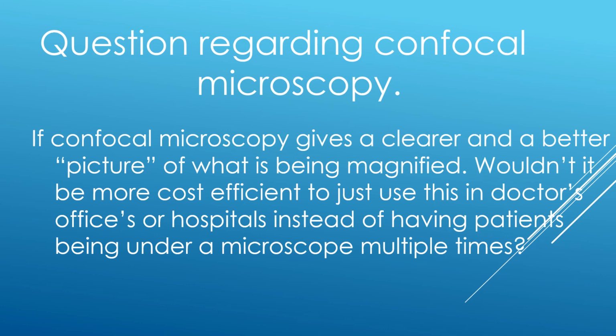So the question that I think should be answered for this is, if the confocal microscope gives a clearer and better picture of what's being magnified, wouldn't it be more cost efficient to just use this in doctors' offices or hospitals instead of having patients be under a microscope multiple times?